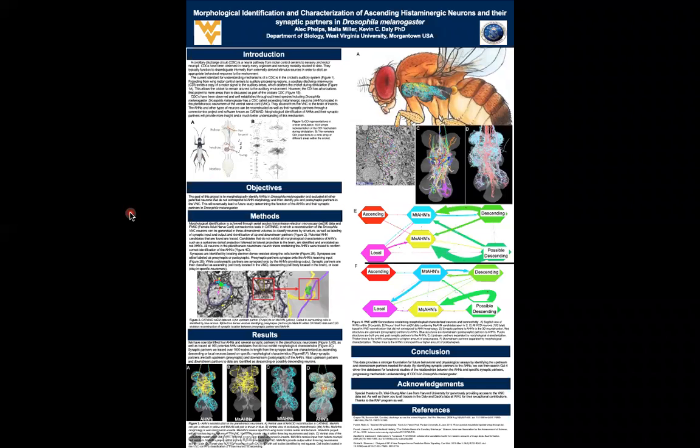This morphological identification is achieved through serial section transmission electron microscopy data combined with female adult nerve cord connectomics tools in CATMAID. These connectomics tools help recreate 3D renderings of neuron morphology by tracing cells deeper into the VNC microscopy data. This reconstruction of Drosophila neurons in three-dimensional volumes helps classify the neurons by structure, as well as labeling synaptic input and output of different partners.